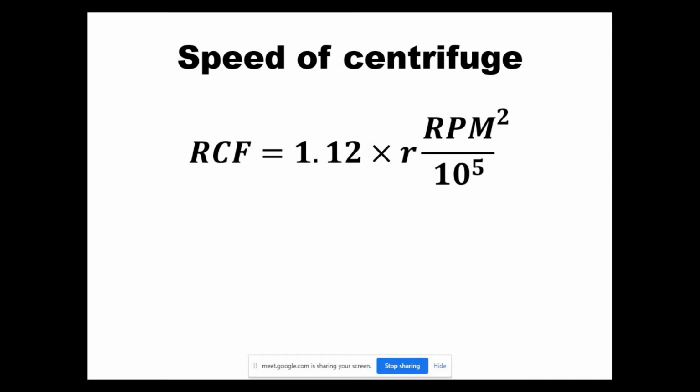In both of our centrifuge machines, we have two readings, I mean two methods of centrifuging. One is RPM, one is RCF. So instead of setting the speed of the centrifuge in terms of RPM, you use the RCF. If you use the RCF in either the smaller or the bigger machine, you won't have any problem.